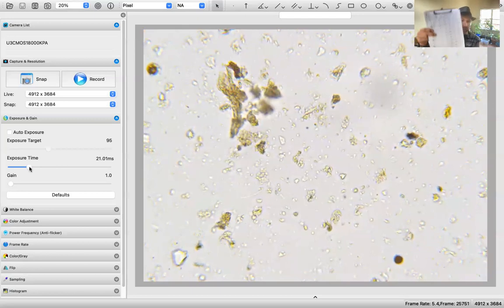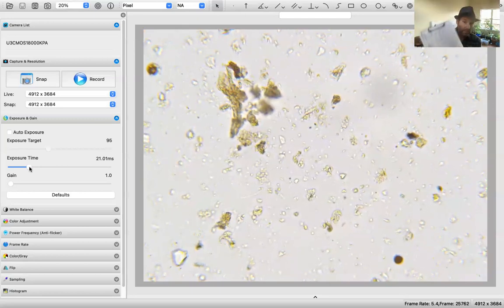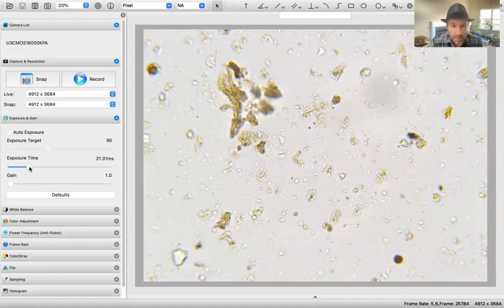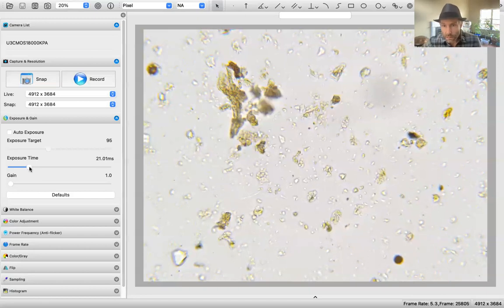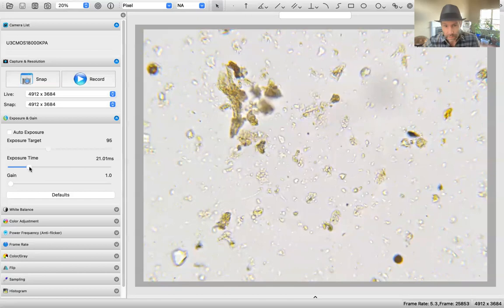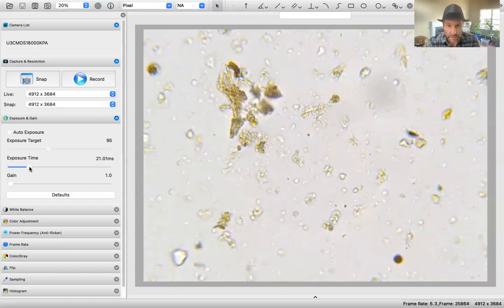And I also have my handy chart here that I made. It helps keep everything in order. So let's see. A lot of movement. Looks like it's all bacteria. I don't see any testates and no fungi.